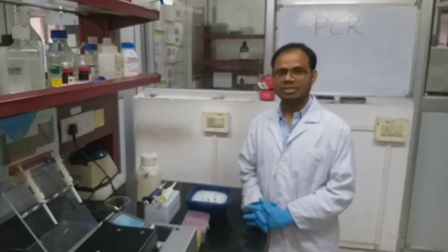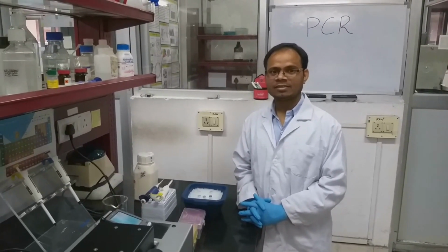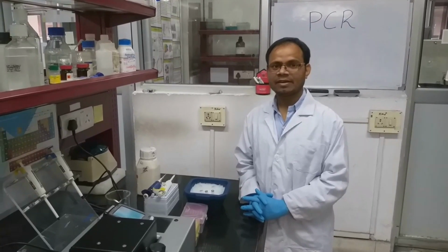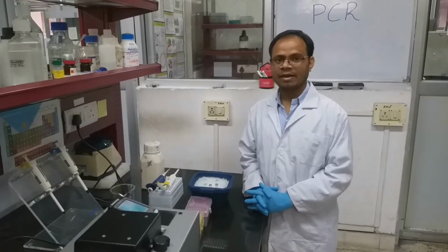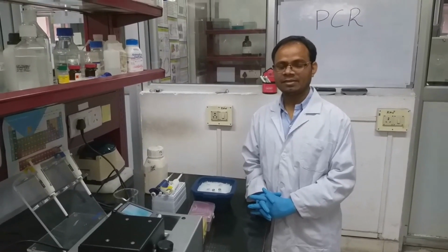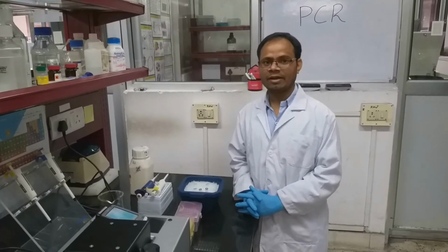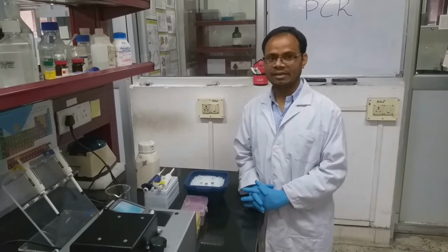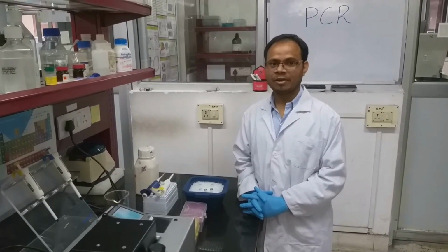To set up a PCR reaction, we need template DNA, site-specific primers, dNTP mix, nuclease-free water, and Taq polymerase. For a 50 microliter reaction, typically 10 to 100 nanograms of template DNA is used and 5 picomoles of each primer will be used.